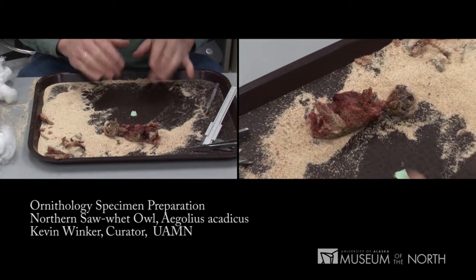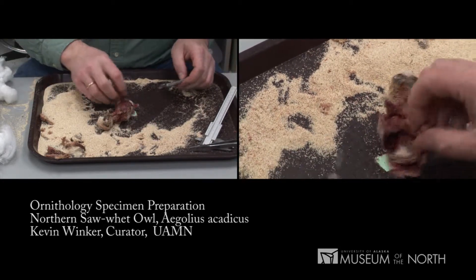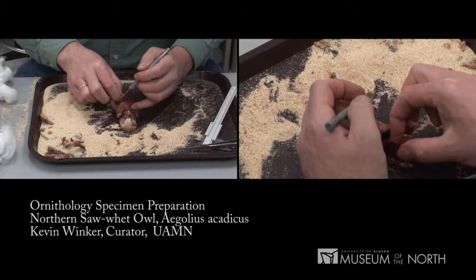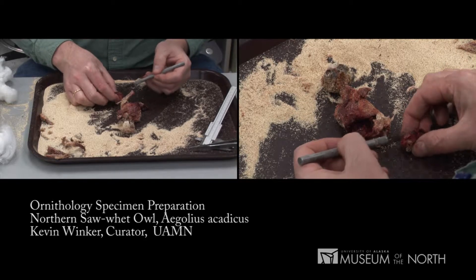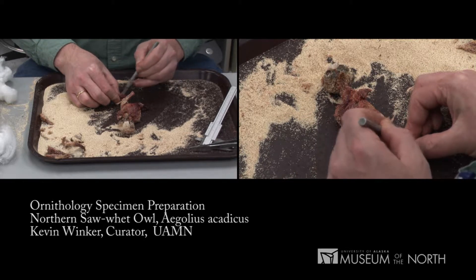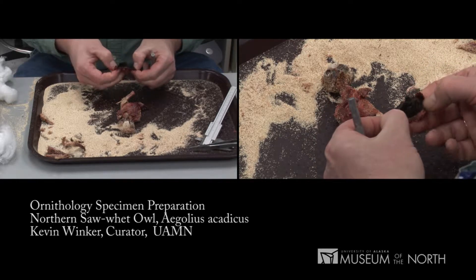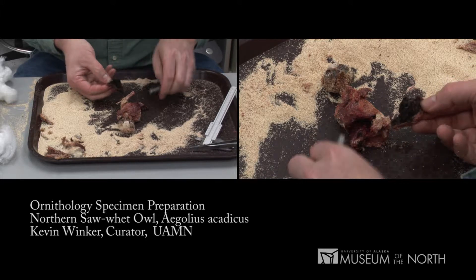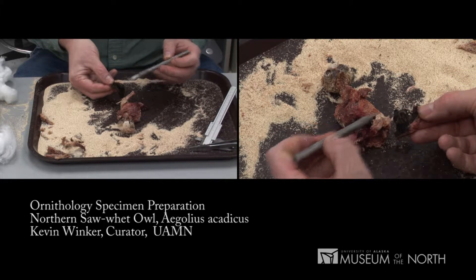We've sexed the bird, we've taken tissues. What we need to do now is to remove the bulk of the meat and allow this partial skeleton to dry. One thing we haven't done yet is take a look at the stomach contents. I pulled the stomach out, pulled it out of the way when we sexed the bird, cutting it open from the side. Opening it up to have a look — it died with a full stomach, and it looks like it was eating a bird, a passerine.